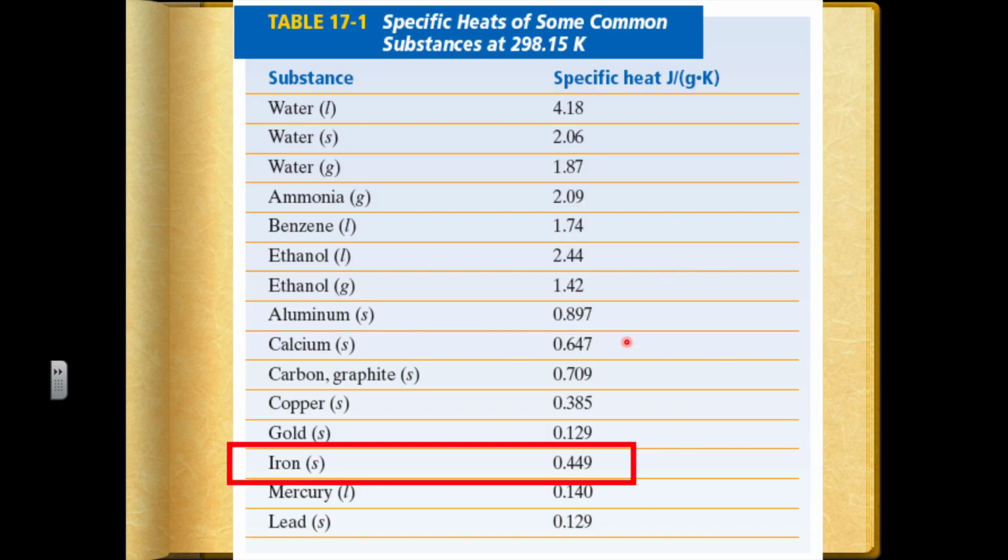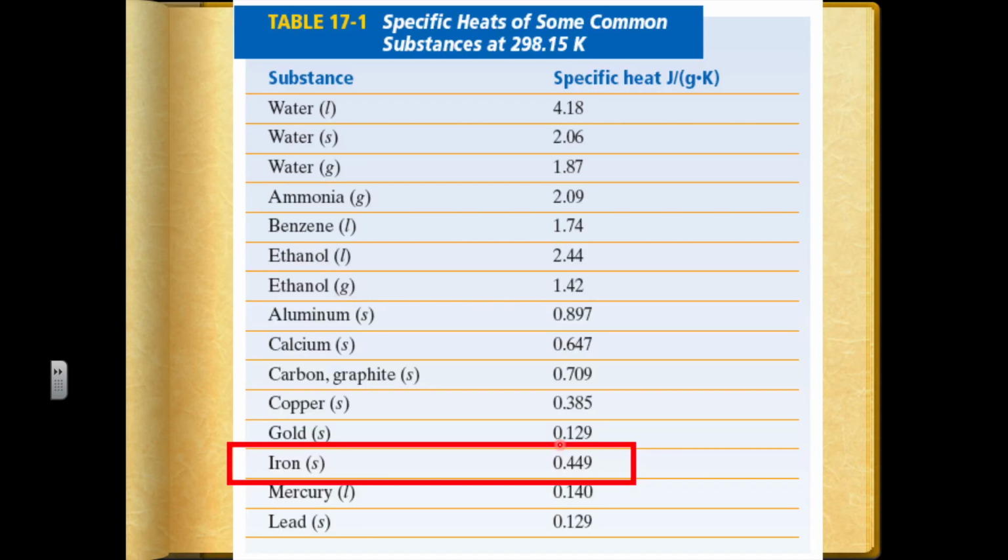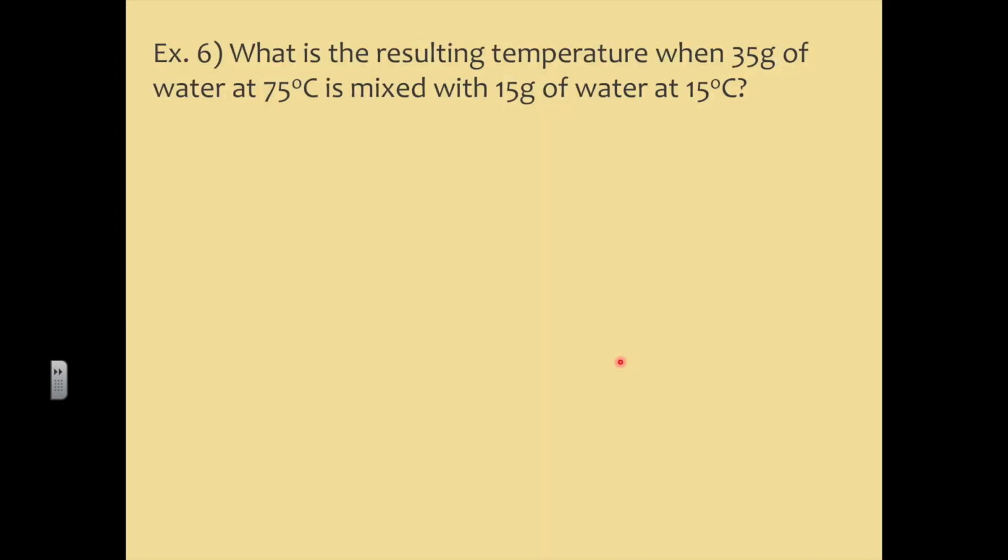By the way, you can take this as your actual value right here, and you can take this as your experimental value and find a percent yield from that. Very cool. That would be a nice investigation.